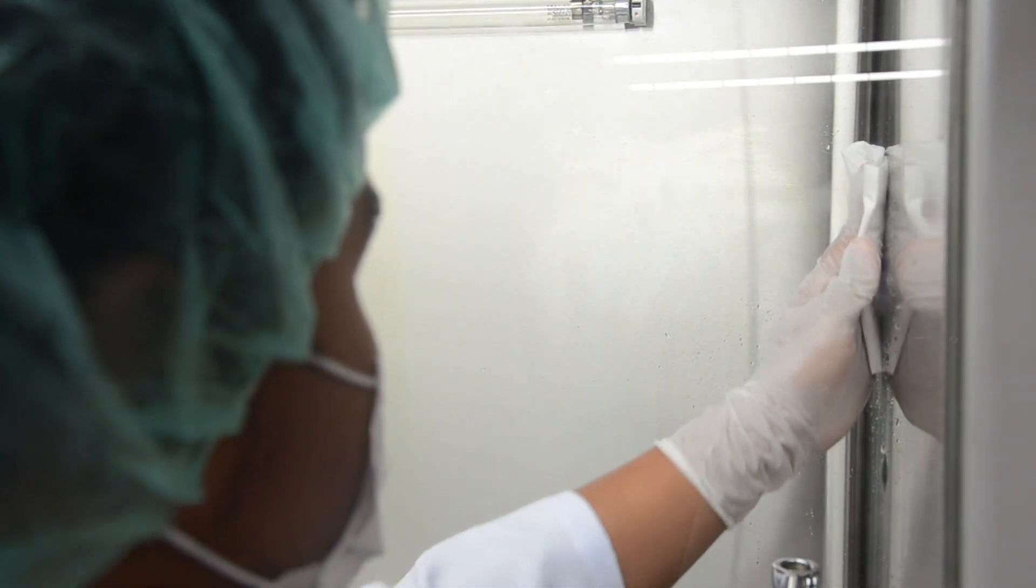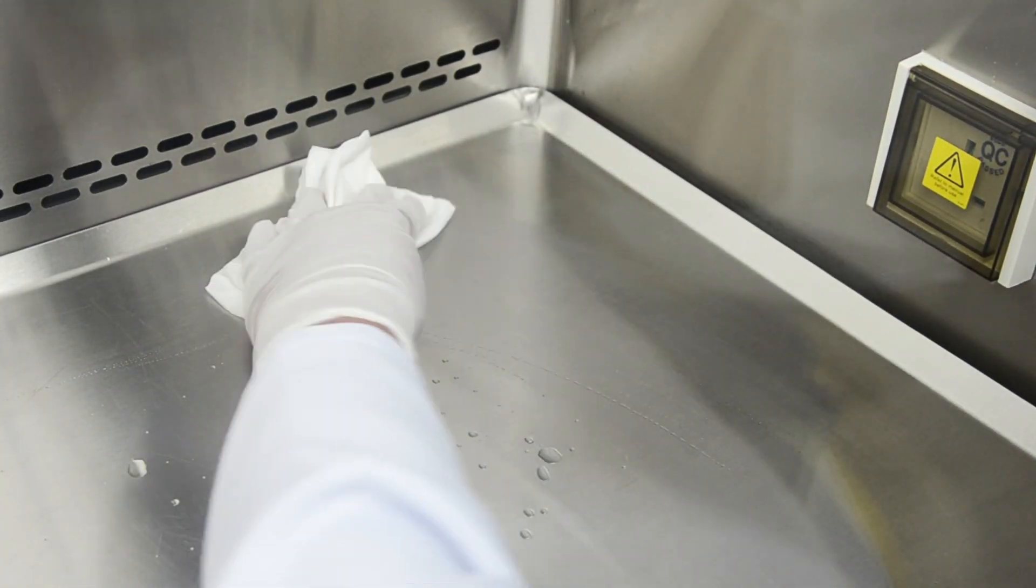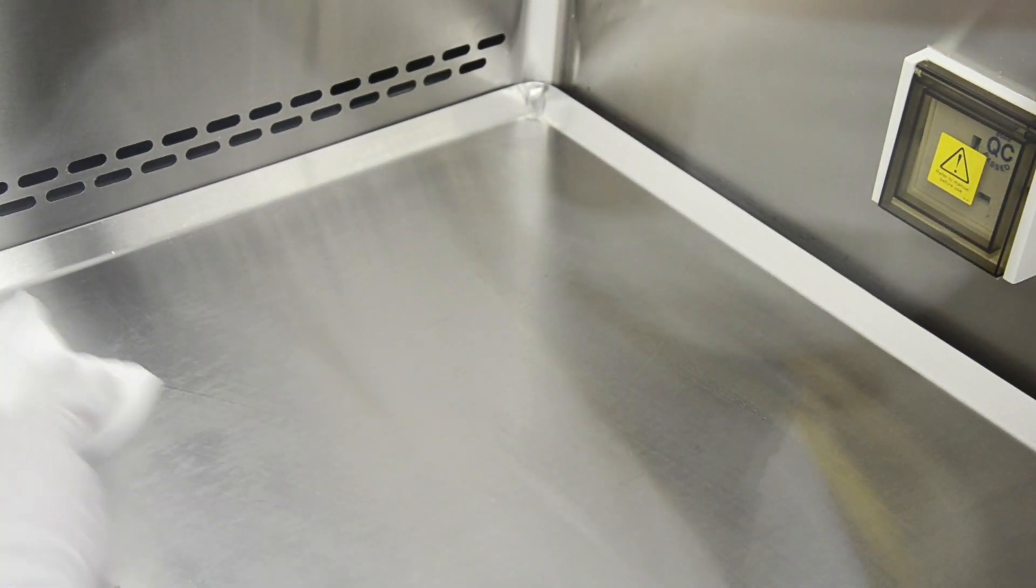Its coved interior, wall corners, and smoothly-finished angled drain pan were designed for easy cleaning, preventing accumulation of contaminants in your work zone.